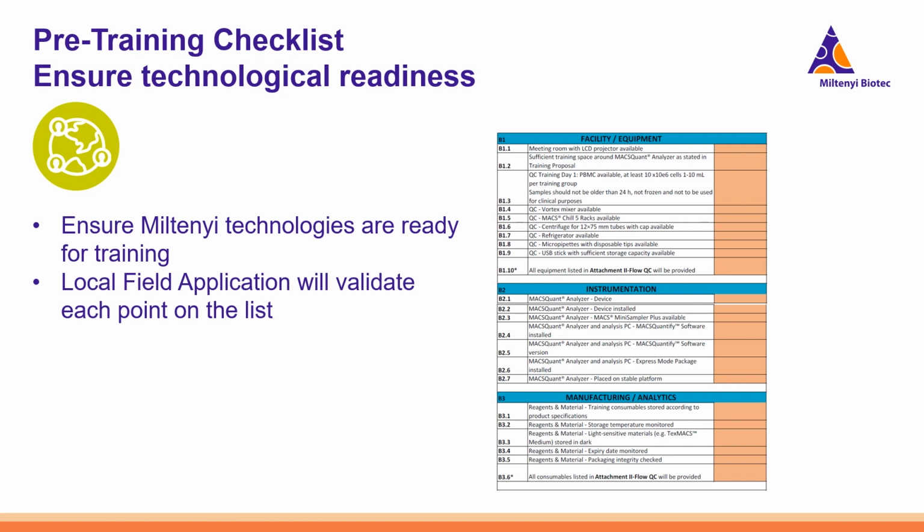Usually, we have field application specialists, and the local field application specialist will visit the site and validate each of the points to make sure that all the equipment and all the reagents that are necessary are present in order to ensure the proper and smooth running of the training.